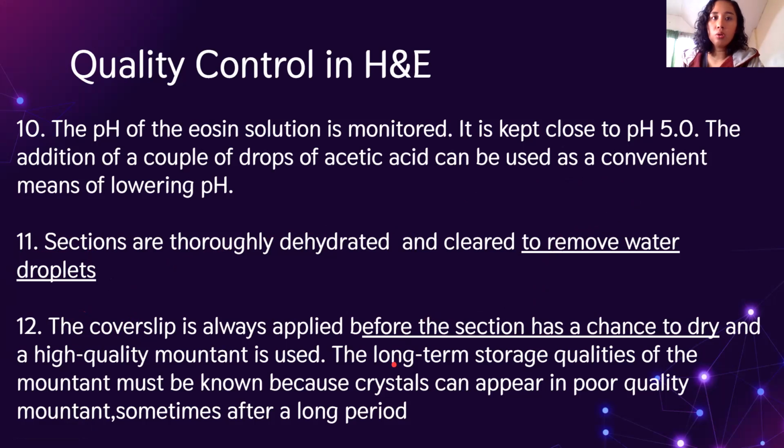Okay? So, the cover slip is always applied before the section has a chance to dry. So, we don't allow your section to dry out. Okay? So, nandoon lang siya nakababad sa xylene unless you are ready to mount it. That's the only time that you will remove it in your xylene. Okay? Ayan. Long-term storage qualities of the mountant must be known because crystals can appear in poor quality mountant. Okay, so huwag gagamit ng expired or poor quality mountant kasi it will produce crystals.